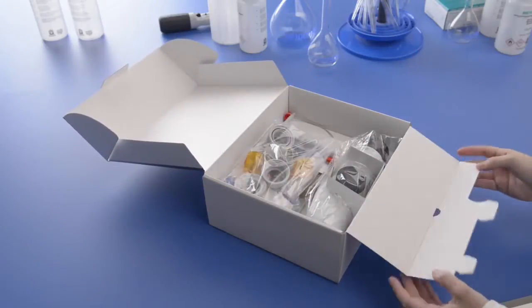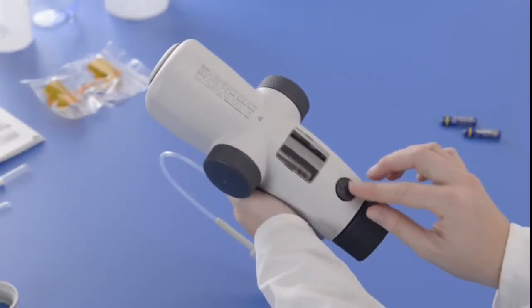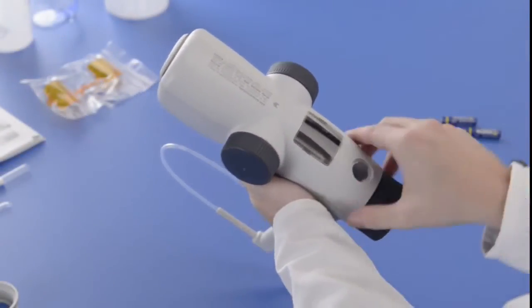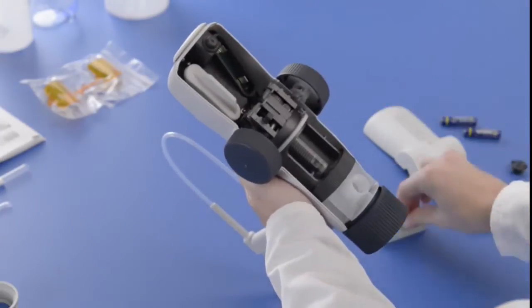Unscrew the air vent cap from the housing to remove the rear housing. Then remove the battery case covers.